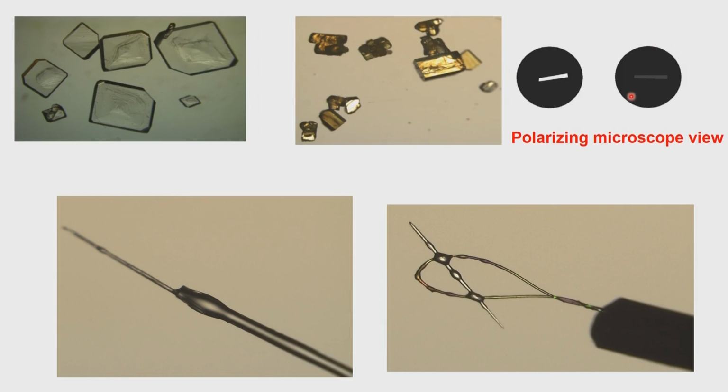So, if we put the crystal under a polarizing microscope and then move the polarizer, the Nicol prisms, in such a way that we will have an extinction of the light which is coming from this crystal. So, the crystal is in this orientation, polarized light is sent in, and as the polarizer is rotated, we will have extinction. So, complete darkness comes up, and again when we rotate another 180 degrees of the polarizer, we will get the crystal picture like this. So, this is very important before we decide to take the crystal onto the machine.